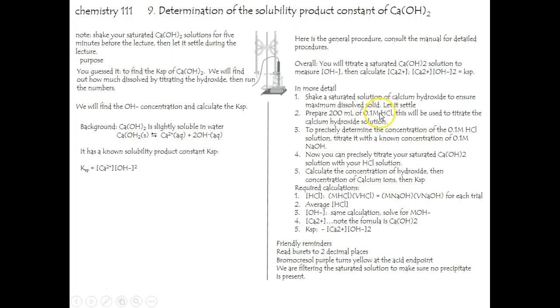Now, we've made this thing by hand. We know it's about 0.1 molar, but if we're going to get good data, we better standardize it and find out exactly what it is. So, you will be given some highly precise standardized sodium hydroxide solution, and we're going to titrate your HCl solution that you've made to come up with more significant figures, more precision for its exact concentration.